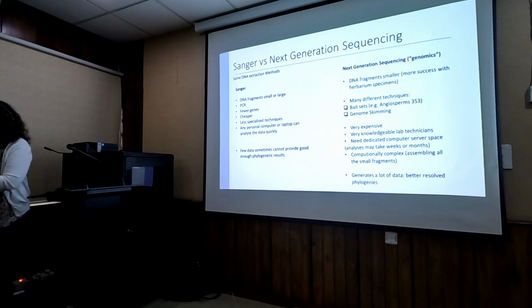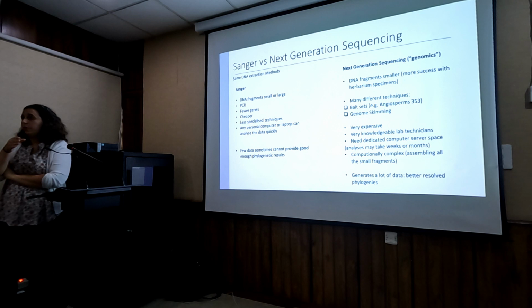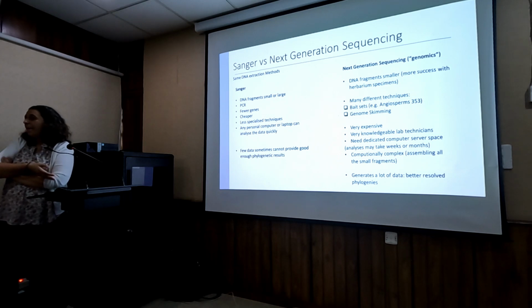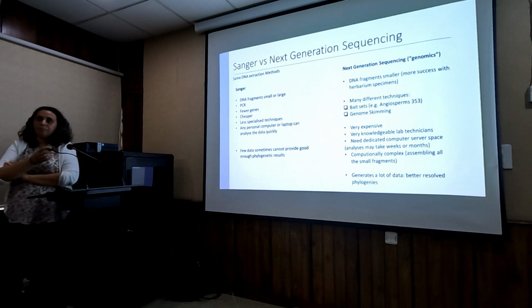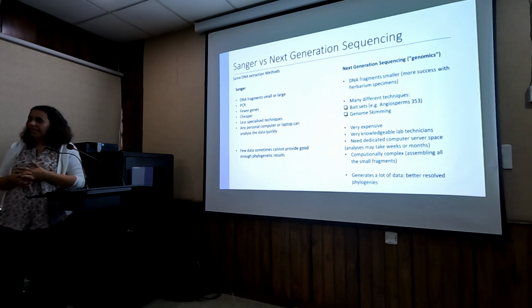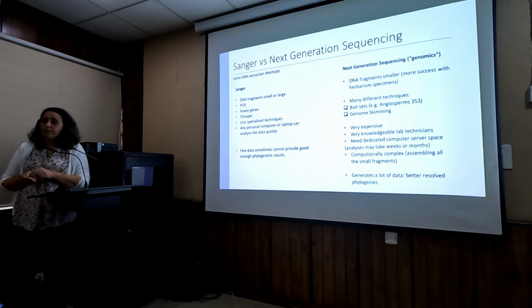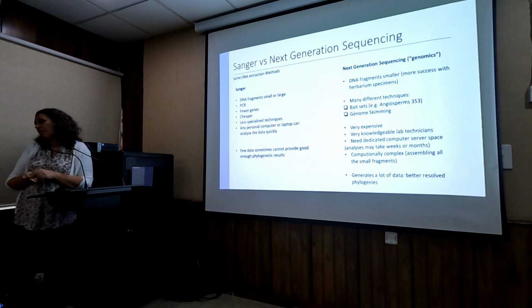Yeah, that's actually my next slide. And it's something I've experienced recently myself, when I've done a whole plate of next generation with herbarium specimens, and we had a lot of problems, but not with the extraction. So it extracted well, but then with the copying, we're not quite sure what happened. But at some point, everything failed; it just wouldn't copy. It can't be too fragmented. So I think this is a key issue. It can't be so fragmented that it's smaller than the primers, because then you can't copy it.